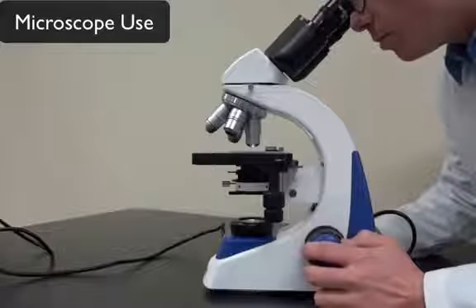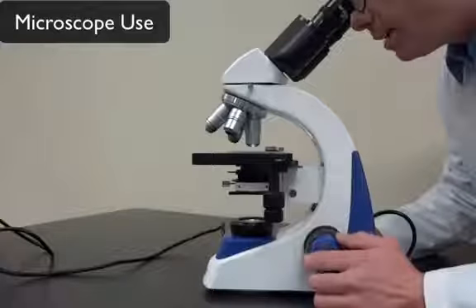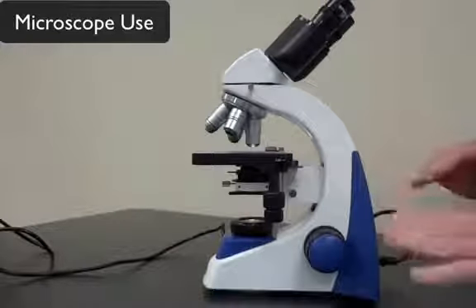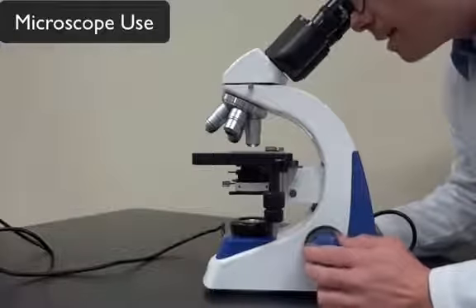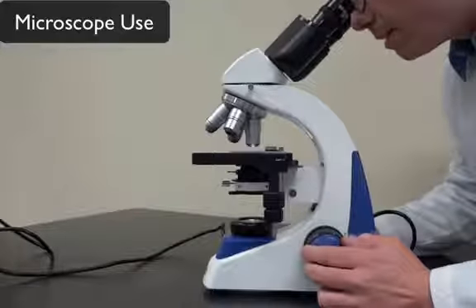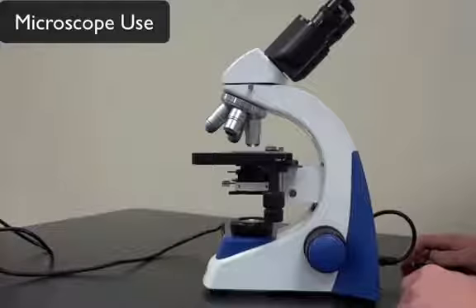So you're going to go back a bit, and it looks like it's getting a little blurrier, and then you're going to go forward, and you're going to find that focus point. So you're going to tune in and say, oh yeah, right there, everything's in focus. Okay, so I only used the fine adjustment there.